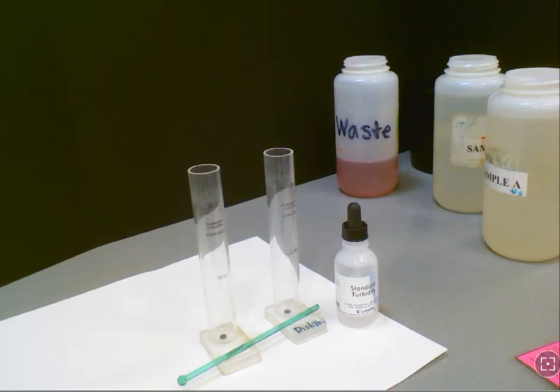For this test, we're going to talk about turbidity. Turbidity is a measure of clarity of water, and it's important to remember we're going to be comparing your stream samples to distilled water. Distilled water is always clear. Stream water always has some sort of color to it, so please don't test for color. You're actually testing for how clear or cloudy that water is based on the test.